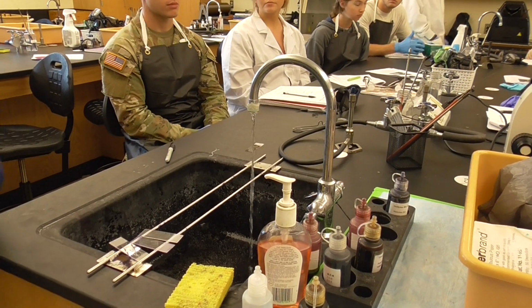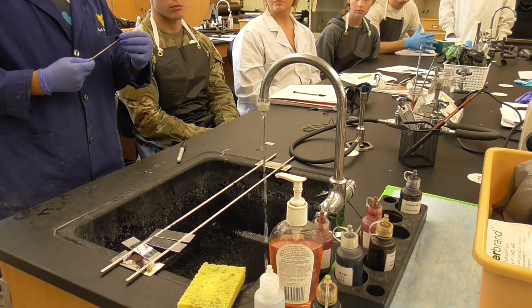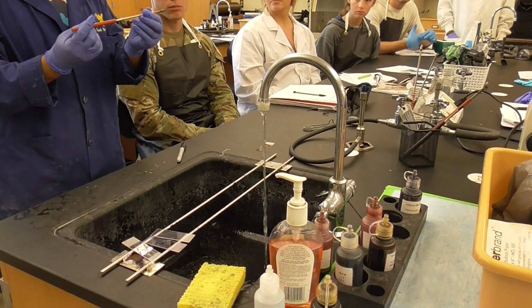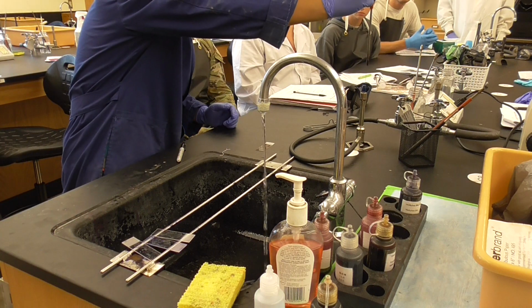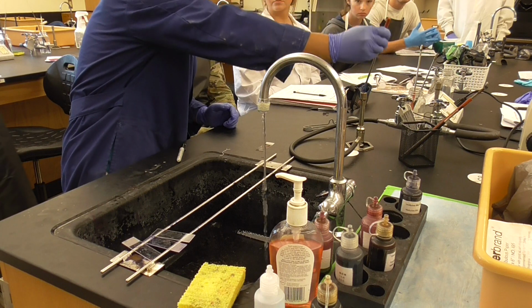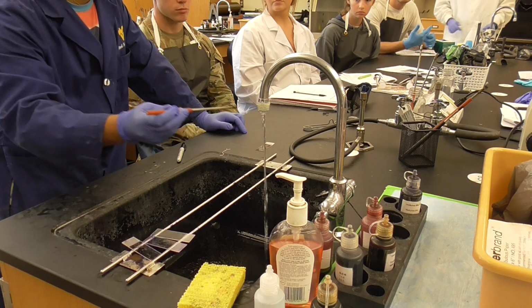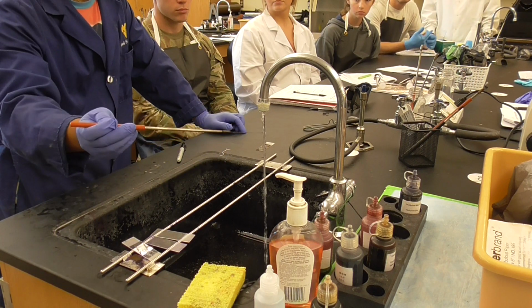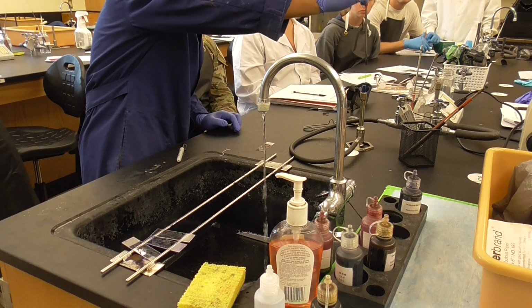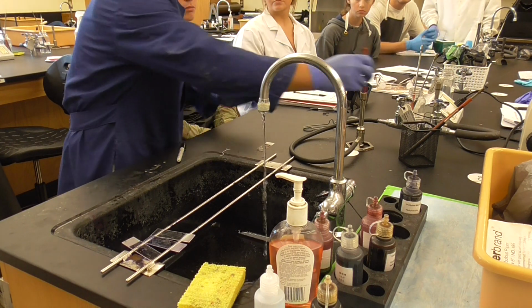Okay. Now how to do the bacteria pick? We first are going to pick up the water. So make sure this is straight. Okay. So we're going to face the loop toward the Bunsen burner a couple of times. Make sure it's all red, which means it has killed the bacteria and sterilized. So you're going to add the water. Okay. Very tiny drop. That's good enough. Okay. You have to flame it again. Flame it real quick.